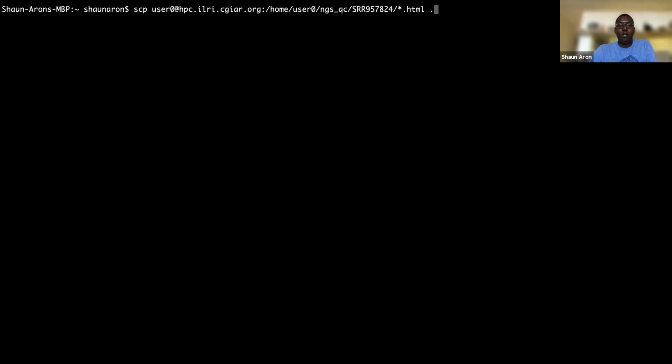Because if you don't type things in perfectly the way it should be, then it throws an error at you. So Jeremy, you need to type it in exactly like that. Also, Jeremy, if you're new to the terminal, you can just remember you can start using the tab to autocomplete. That's usually quite helpful. And sometimes it does prevent you from making errors.